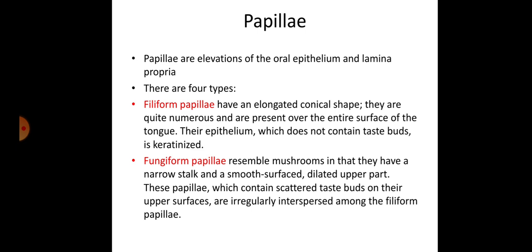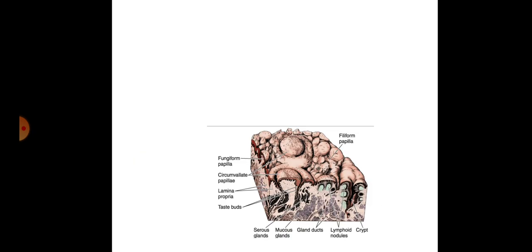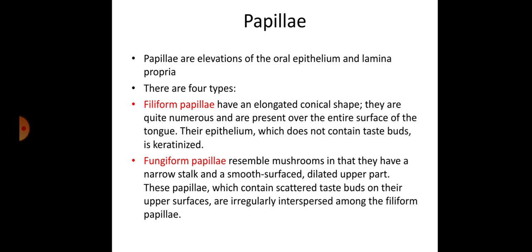This fungiform papillae has a narrow stalk and a dilated, smooth upper part. Okay.